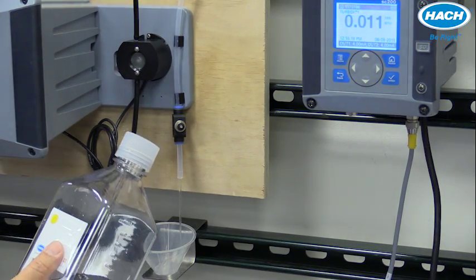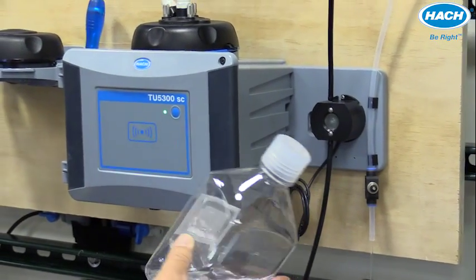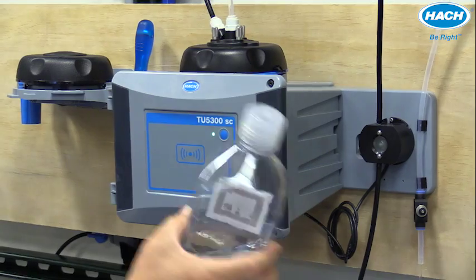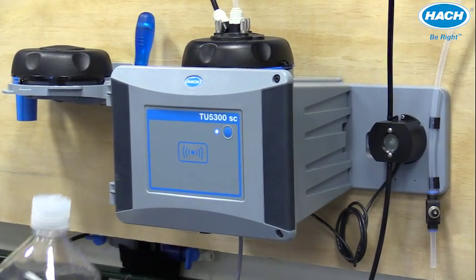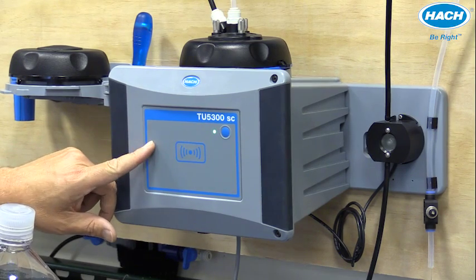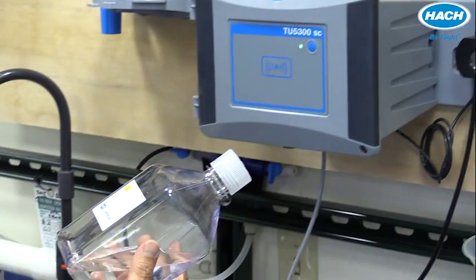Instruments equipped with RFID technology make the process even simpler. We simply swipe the bottle containing the RFID tag right by the RFID sensor on the TU5300. The instrument name, the date and time, and most importantly, the turbidity value is automatically stored to the RFID tag.